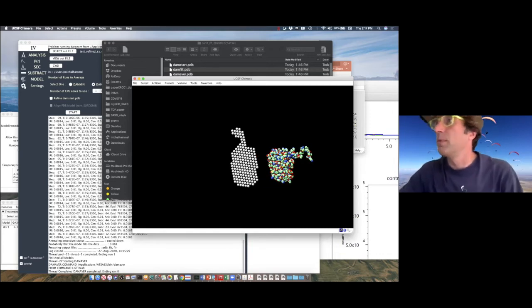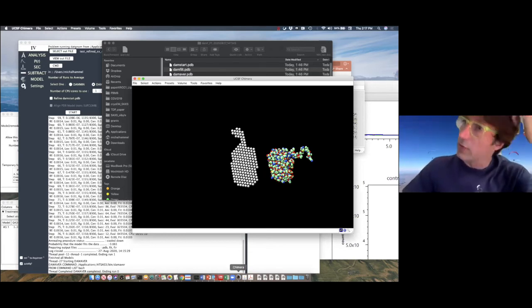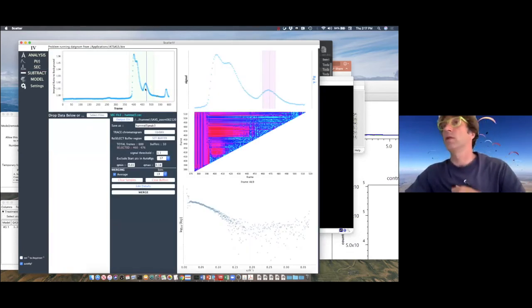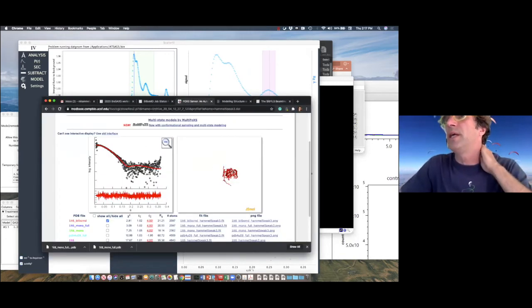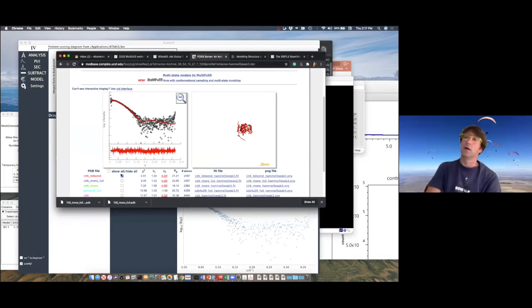Nothing special, I mean, it works. But again, you've done all this work just to confirm that this peak here is not molecule A, but molecule B. The fastest way was just taking the PDB and comparing molecule A and B if you have that information, and comparing that this molecule is not fitting rather than this molecule is fitting right. And it was much faster and much more precise in this case.